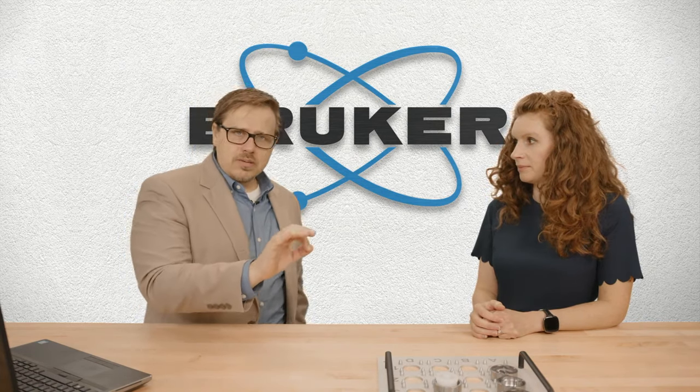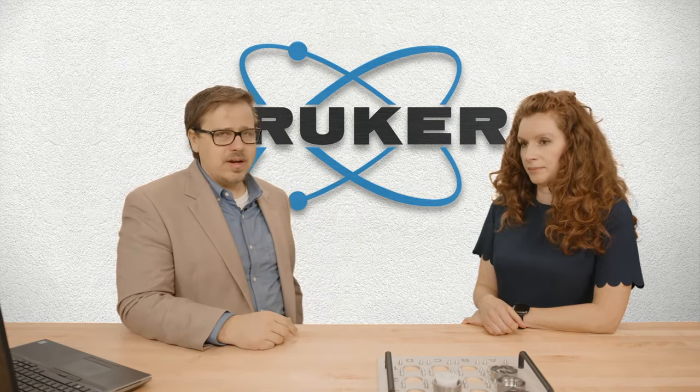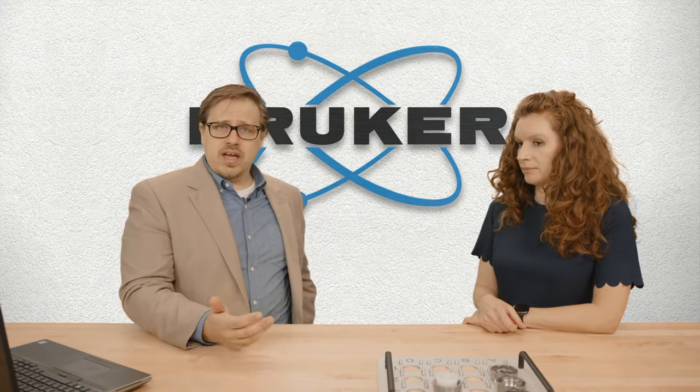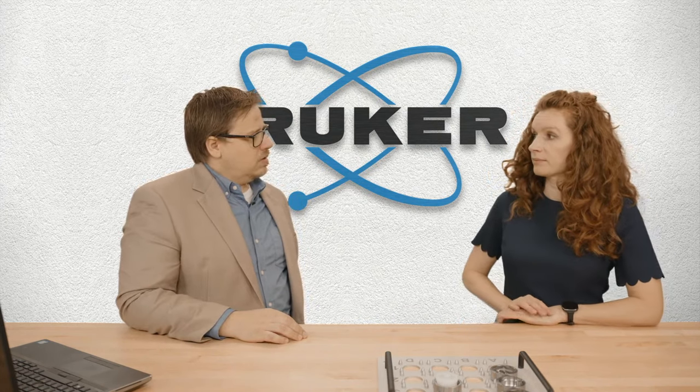In particular with the graphite thing, though, XRD might actually be of help. If you get a lot of carbon into that lattice, I mean, that's basically steel. So the carbon incorporates into the iron lattice. It actually causes a slight lattice parameter expansion. Might be able to measure that. Also, we might be able to pick up the actual graphite. So it's always one of those, you know, work with us, let us know, and we can get you the right answer.